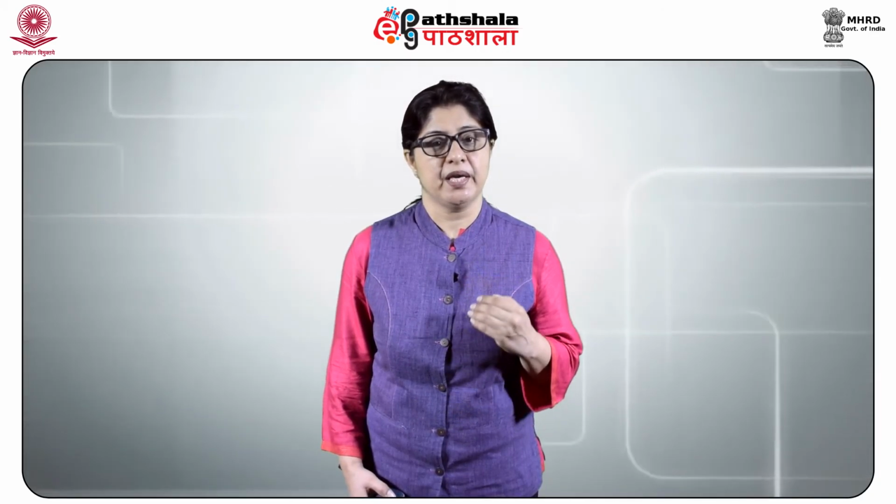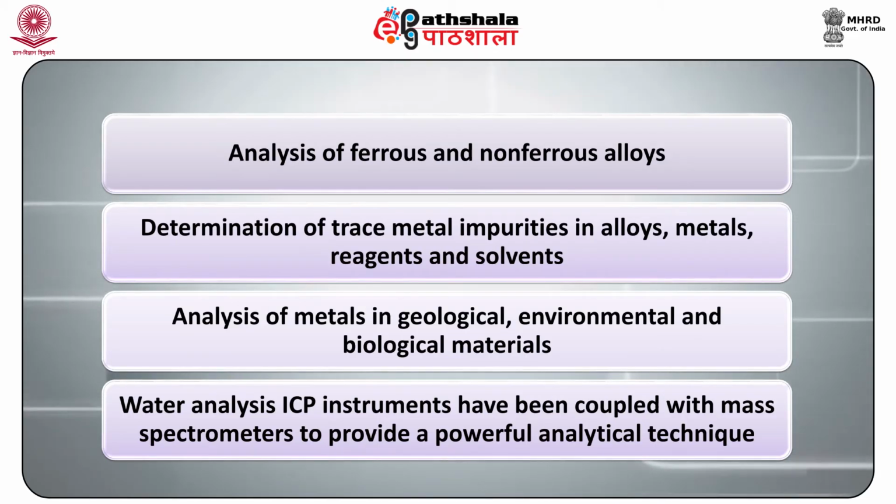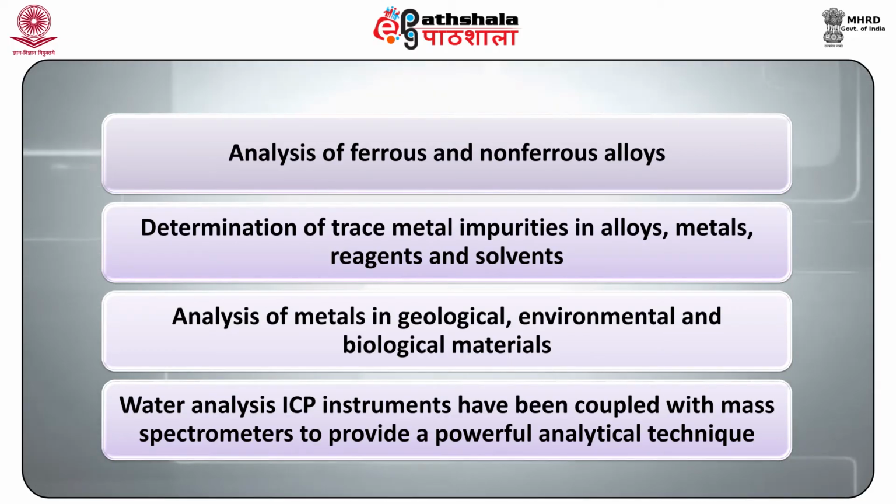Applications of atomic emission spectrometer. AES can be used in the following: analysis of ferrous and non-ferrous alloys, determination of trace metal impurities in alloys, metals, reagents and solvents, analysis of metals in geological, environmental and biological materials. Water analysis. ICP instruments have been coupled with mass spectrometers to provide a powerful analytical technique.